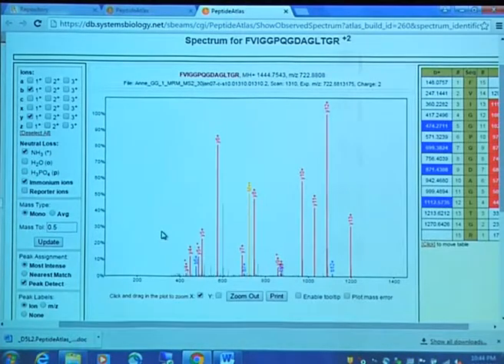What it shows you is that oftentimes when you have a very dirty spectrum with a lot of little peaks, a lot of them can be identified if you try a little bit harder. But when you're just considering the major peaks, it's somewhat of a distraction, so we don't put those on by default. So all in all, a pretty convincing spectrum.